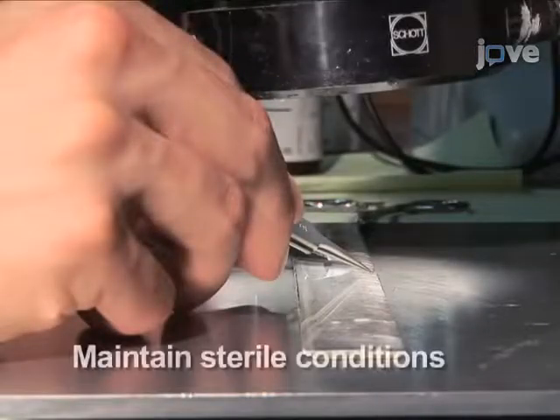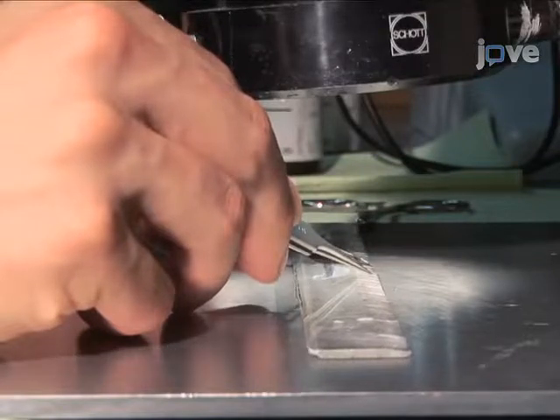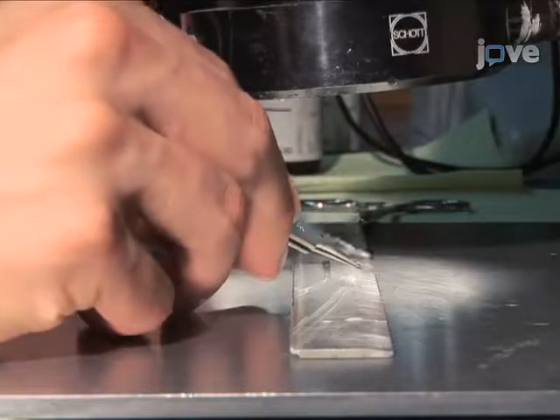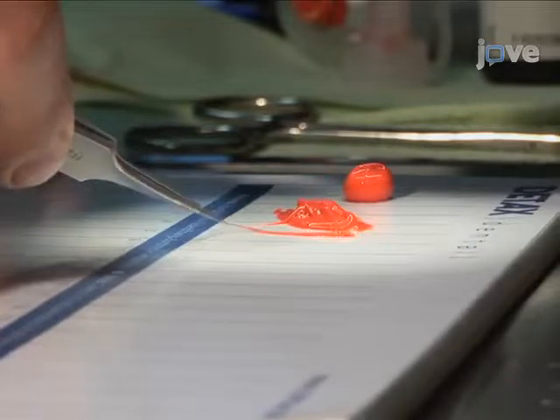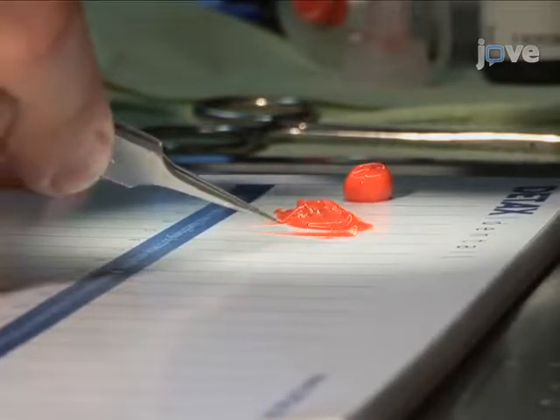Prior to the procedure, prepare the filament by cutting an 8.0 nylon filament into 11 mm lengths under the microscope. The filament tip must be coated completely and evenly over a length of 8 mm with a silicon mixture.